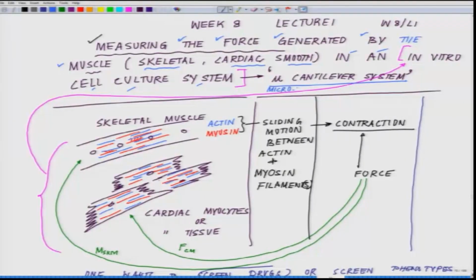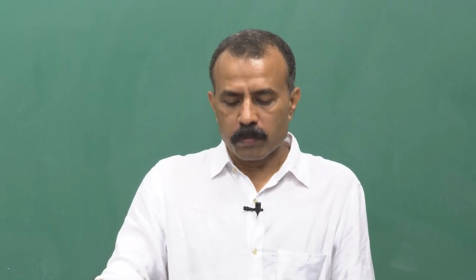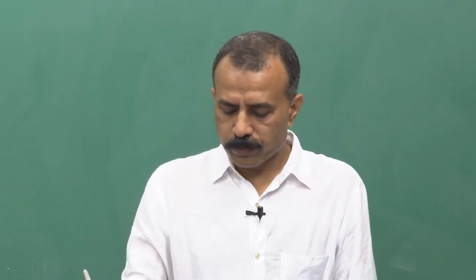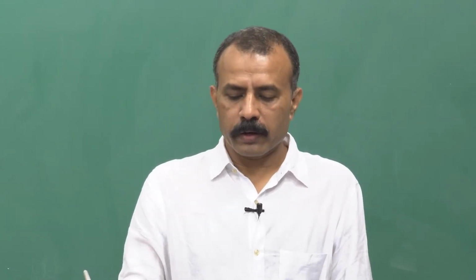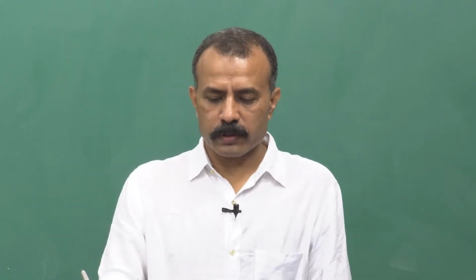What we have learned in these two classes is how, using modern microfabrication technology, you can develop micro cantilevers.